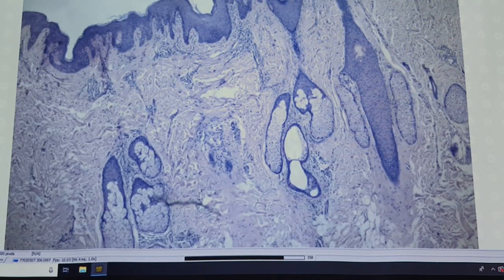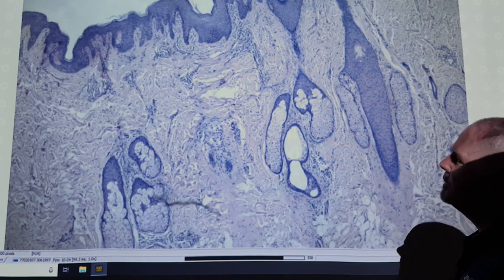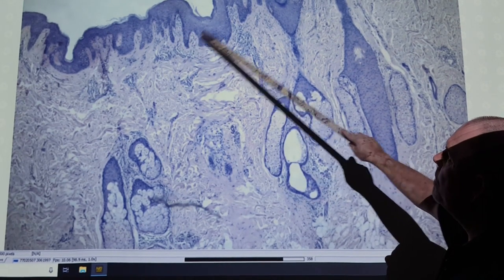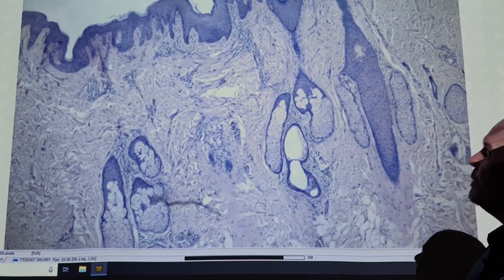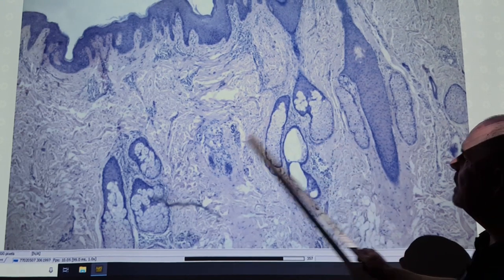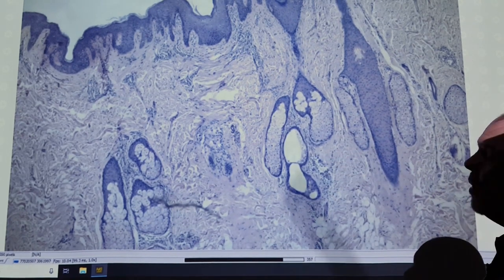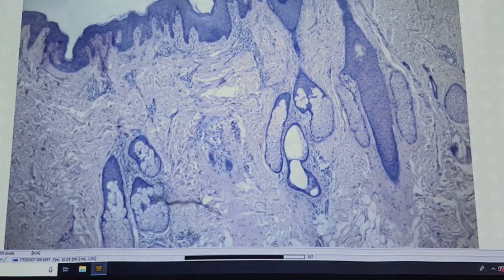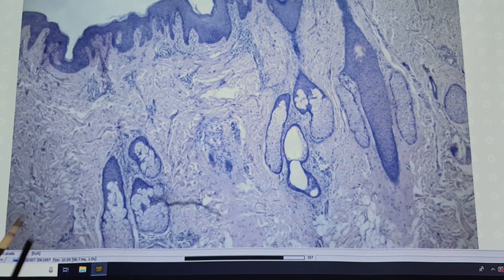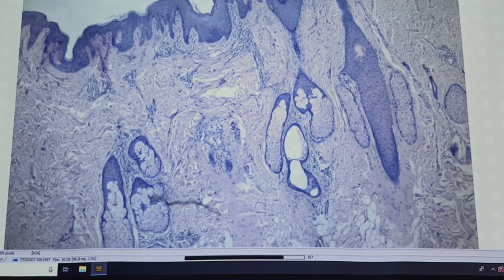Here we're looking at a little chunk of human scalp, kind of oily scalp once in a while, we humans. So I can see my epidermis and my dermis. See those dermal papillae there once again. And the reason I picked this slide of the scalp is because it typically has very good sebaceous glands. That's what these structures are. These are sebaceous glands or oil glands that make hair oil, sebum, and they tend to be attached to hair follicles. This one's cut so you can't see it, but all of these things that you see right here, I think they sort of look like little bunches of grapes or something.